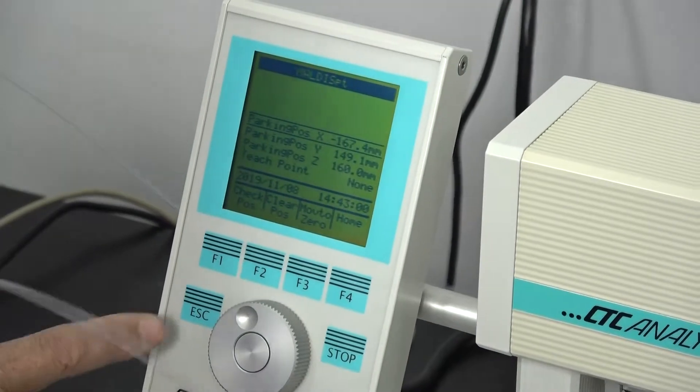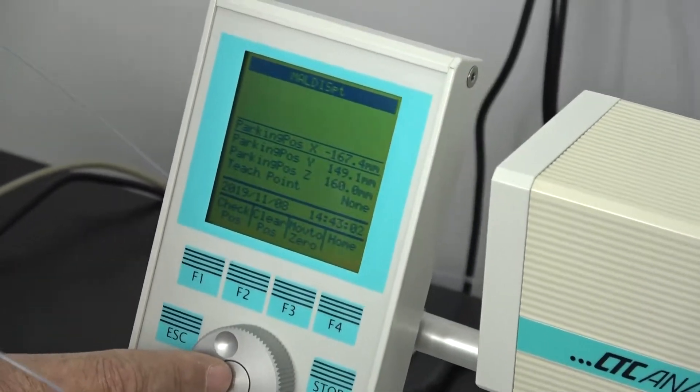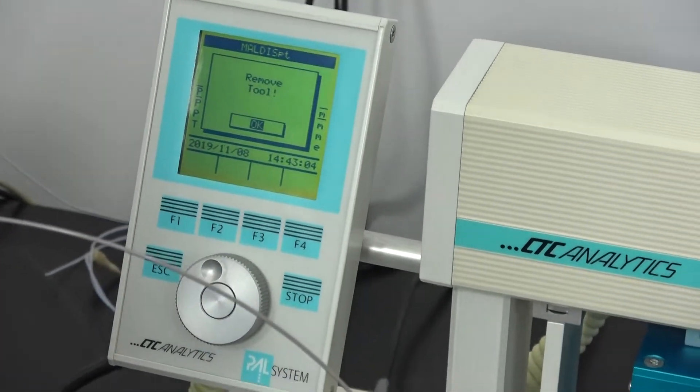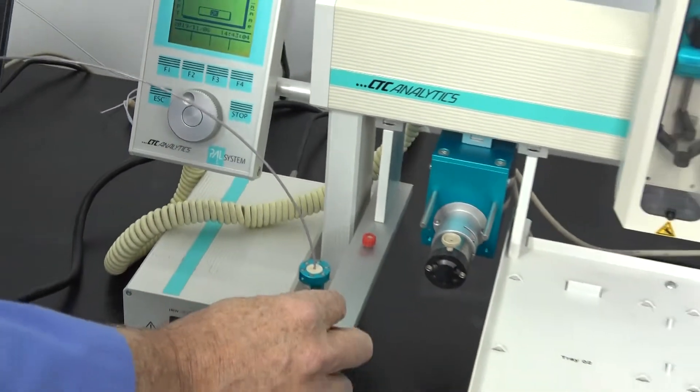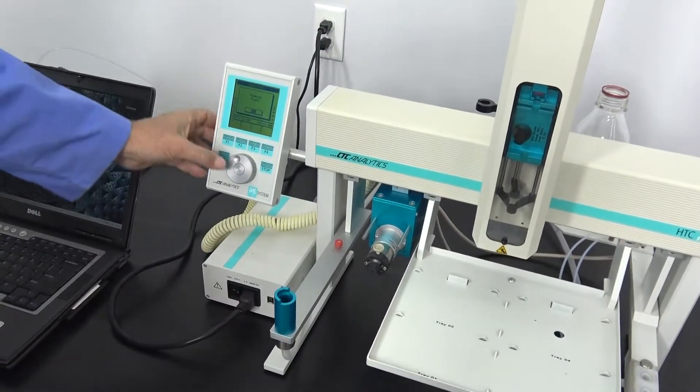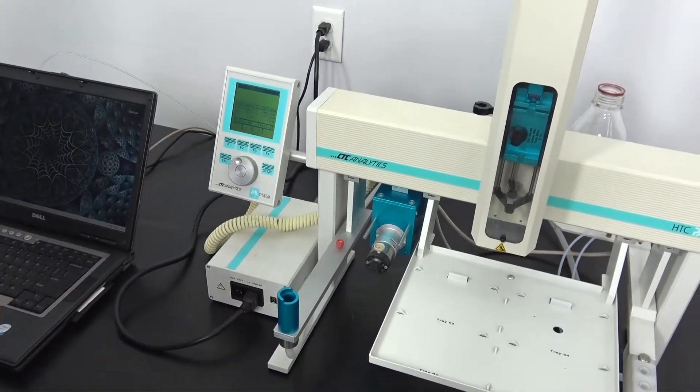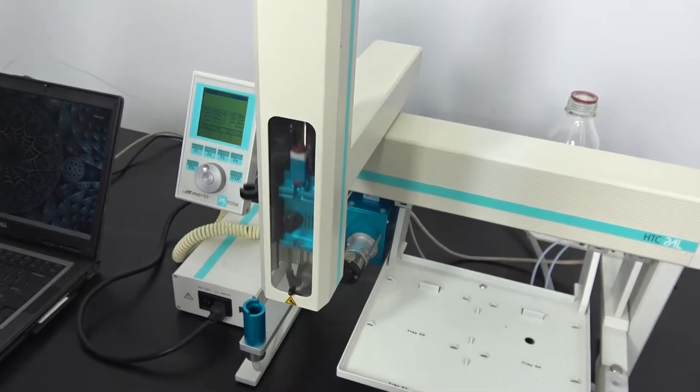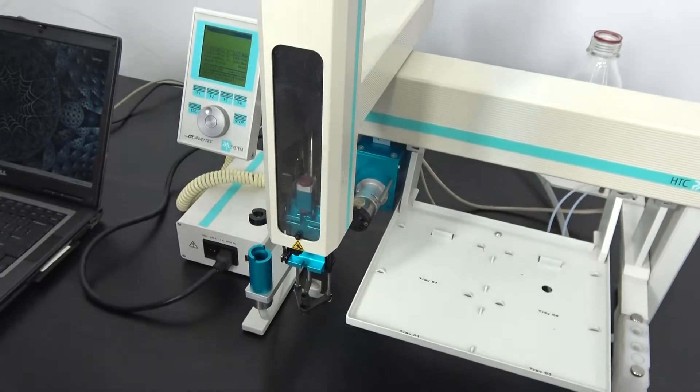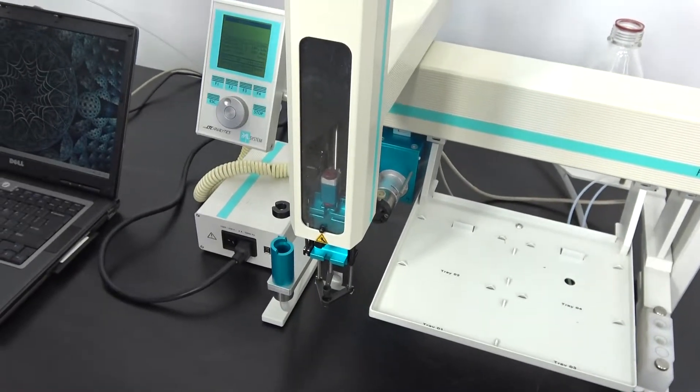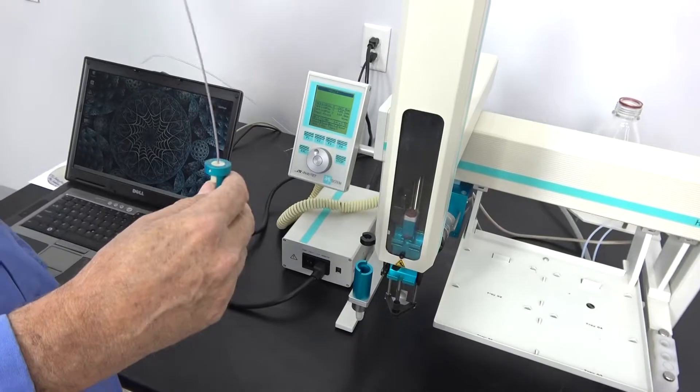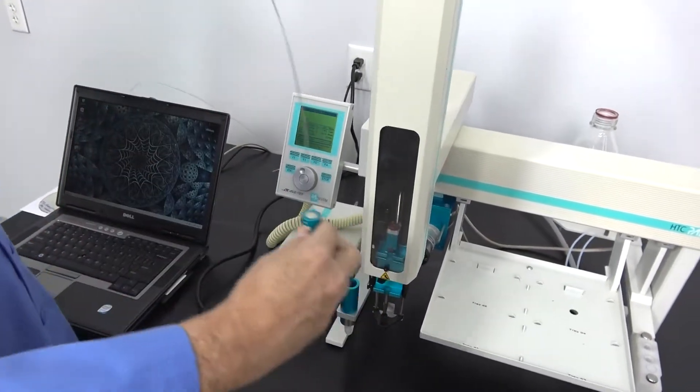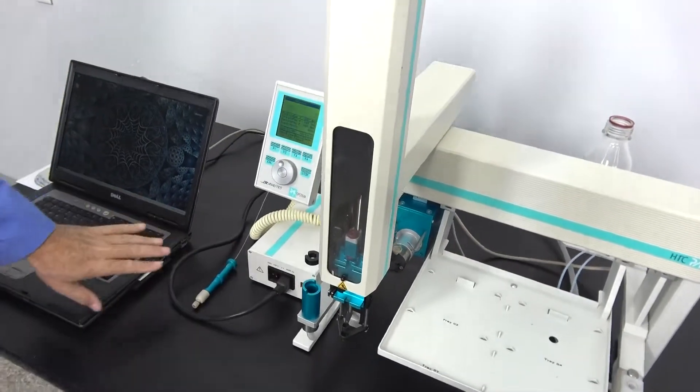As the MALDI option. We can actually tell it to check position. It does warn. We want to remove the tool. I know I have this set correctly, but I'm going to take it out anyway. And then that would drop onto the tool. And then we'd be able to pick it up and move it to auto sample, to fractional collect the sample into our trays. That's what the MALDI option is.